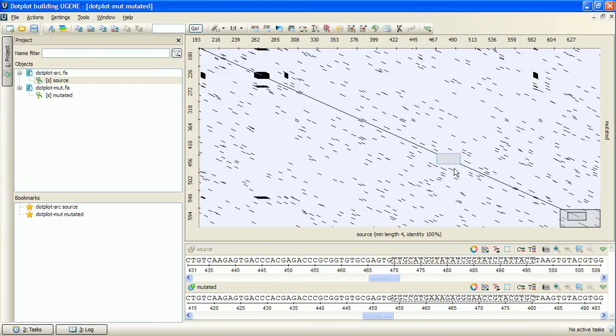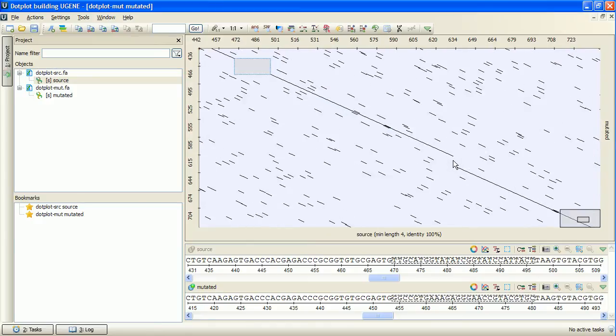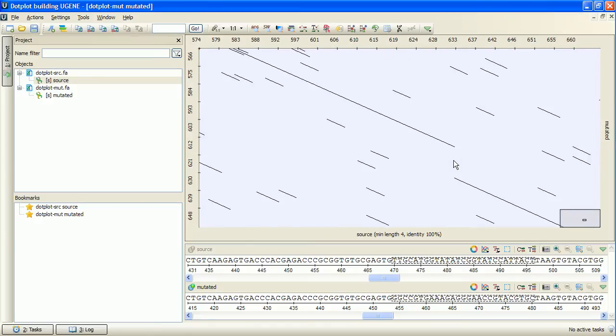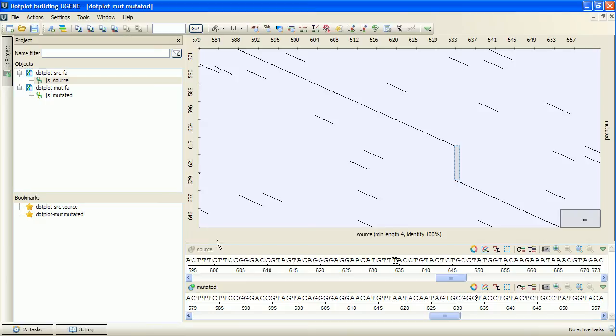The next plot feature is the last kind of frameshift, an insertion. The whole gap is located at the y-axis sequence, which is the mutated one. This means that a subsequence was inserted into the source sequence.